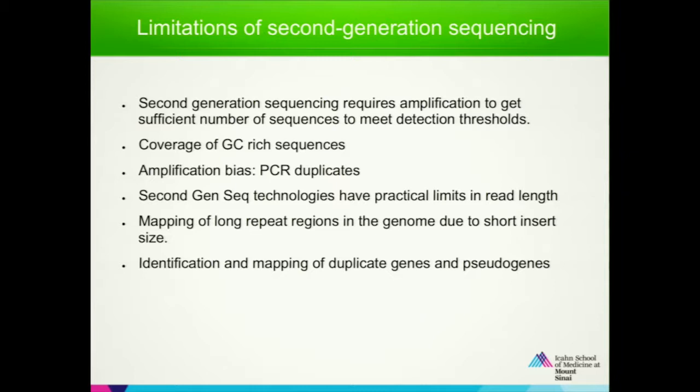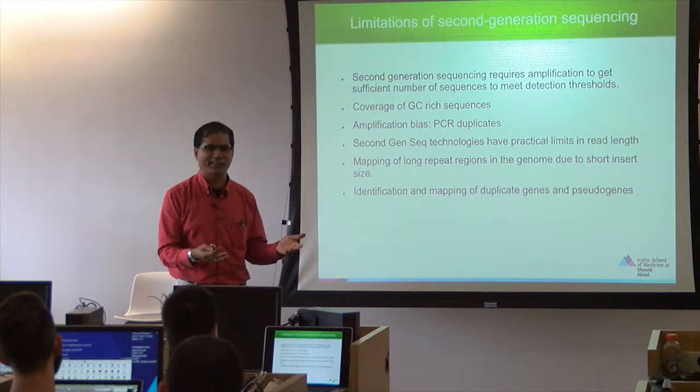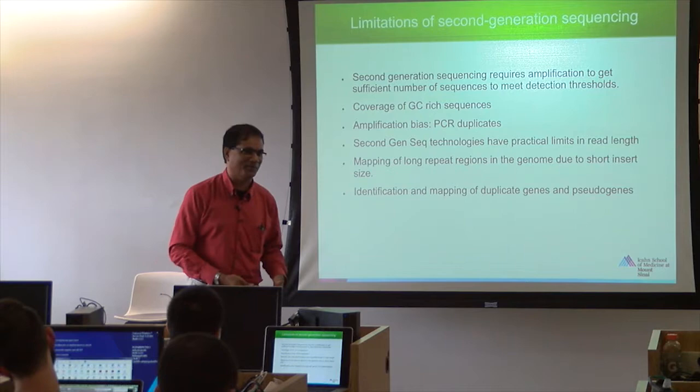Take the entire chromosome, separate it, make it into DNA, and then sequence that. I think that is the ultimate read length. No mapping is necessary, nothing is necessary, right? We can do that. So that is the ultimate one. But what can we do right now? That is the ultimate goal, what we can do.